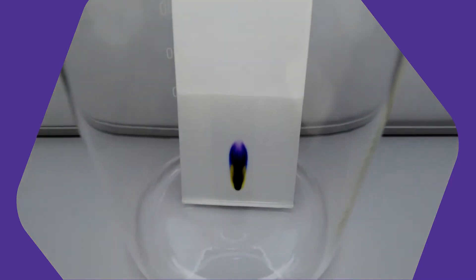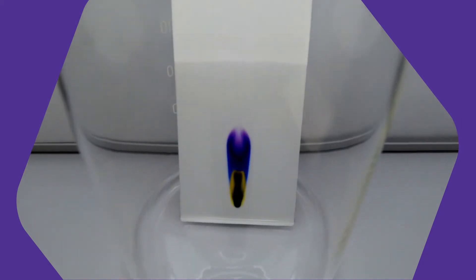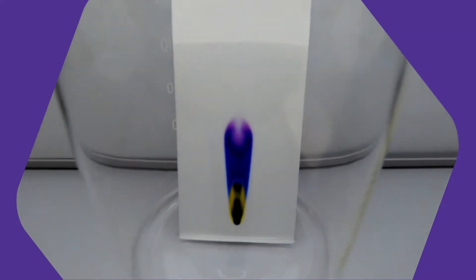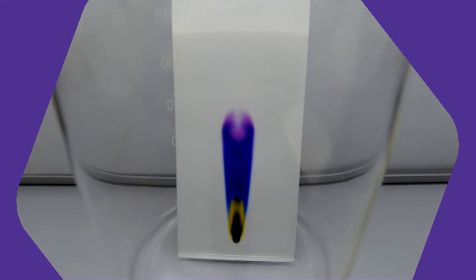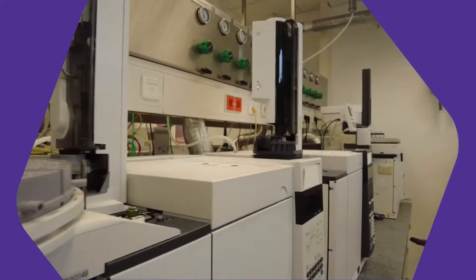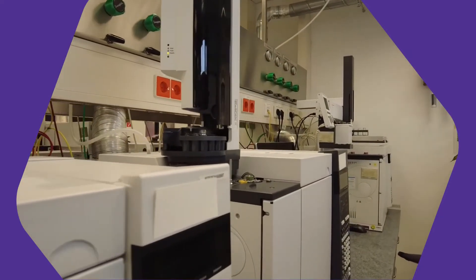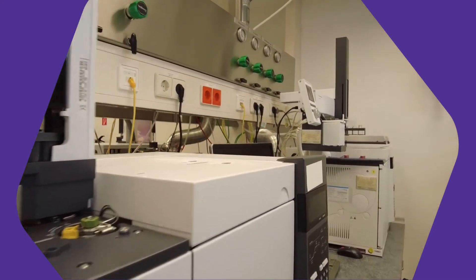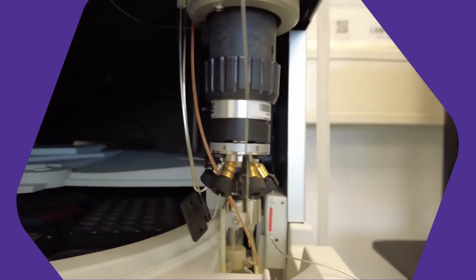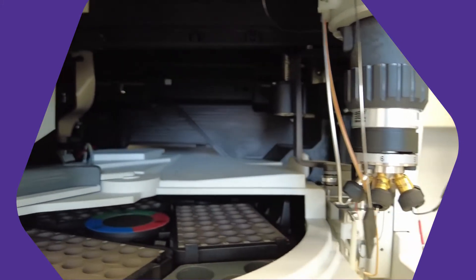In real life the whole process will look like this. The separation took nearly an hour, so I used a time-lapse for the video. This basic principle is used in this lab to determine the actual composition of substances and to determine the exact amounts in the mixture. Various fancy machines help to achieve this.